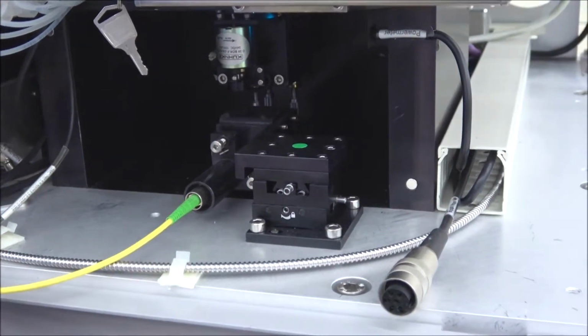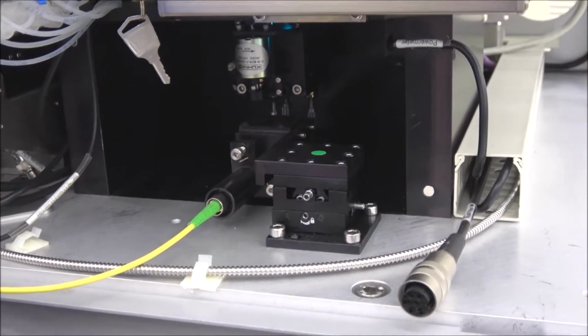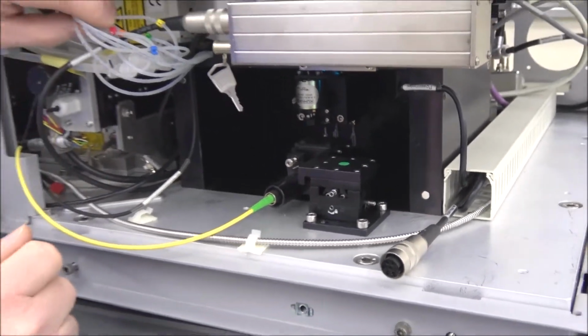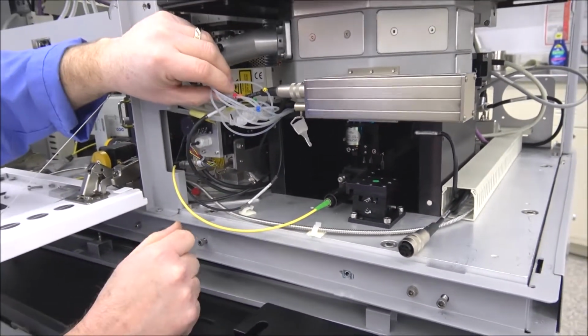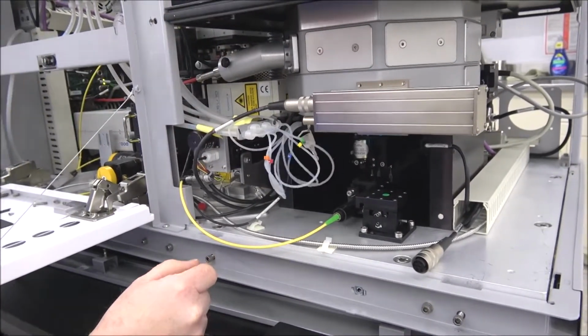And when your machine went out, I believe it was actually focused really well. But I've been kind of tweaking on this machine. Like I said, this one's actually missing a laser, but the other 2 lasers right now are working fine.